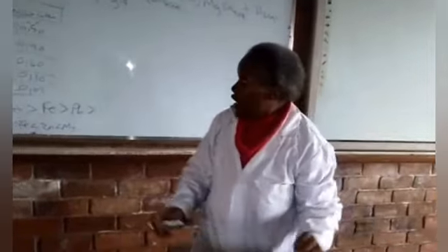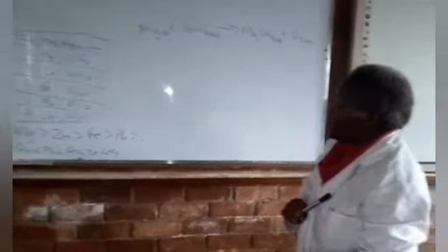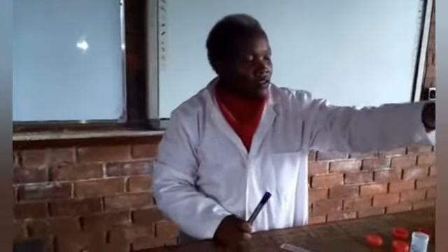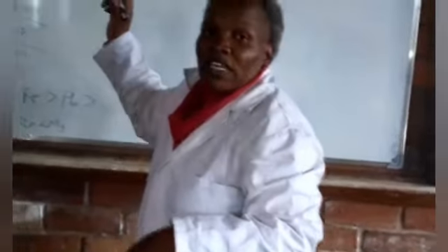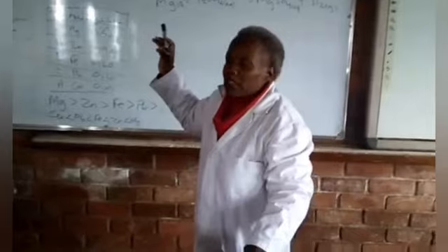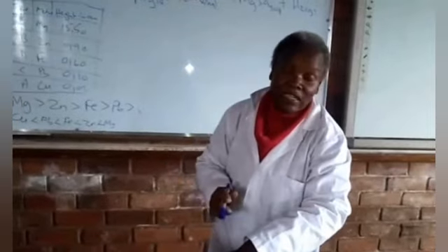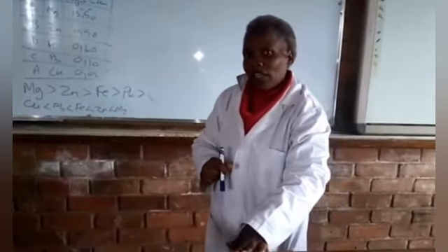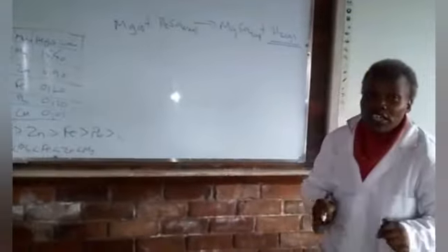Okay, and in this reaction, which was the limiting reagent? Our magnesium completely dissolved. The magnesium completely dissolves, so it means that the magnesium was the limiting reagent, and we have excess sulfuric acid, so some of the acid remains unreacted. So the gas responsible for the bubbling is hydrogen gas.